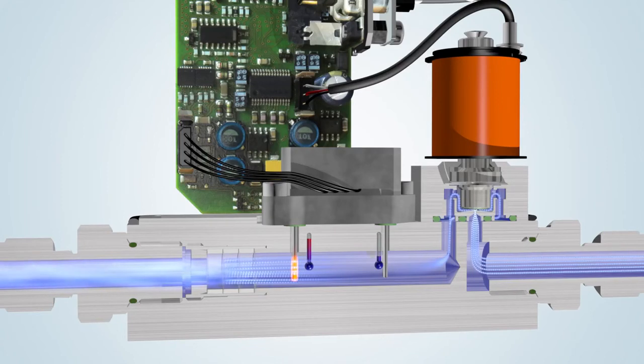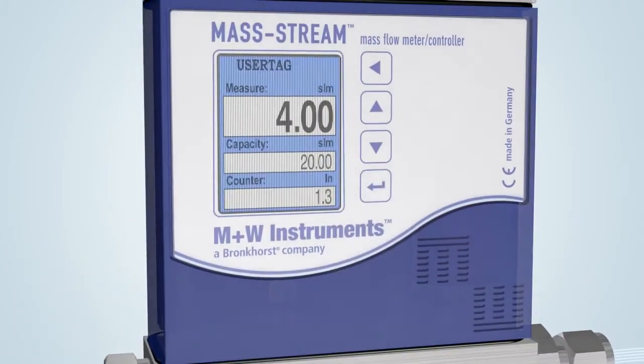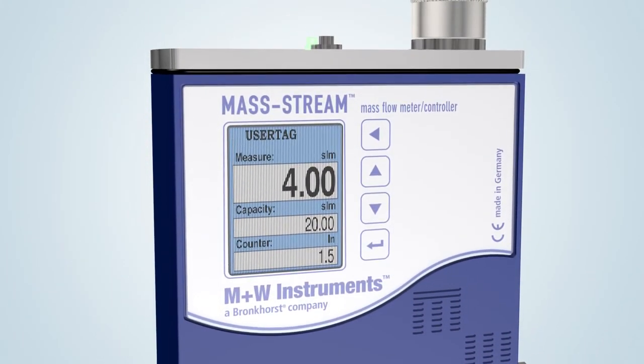One Mass Stream key element is the optional integrated multifunctional and multicolor display with operator buttons on the instrument. The modern-looking display has multiple functions such as actual flow indication, totalization, and alarms, and it is fully IP65 compliant.